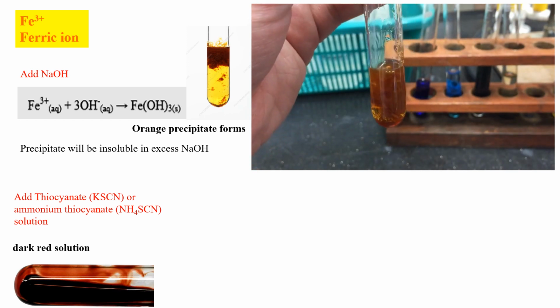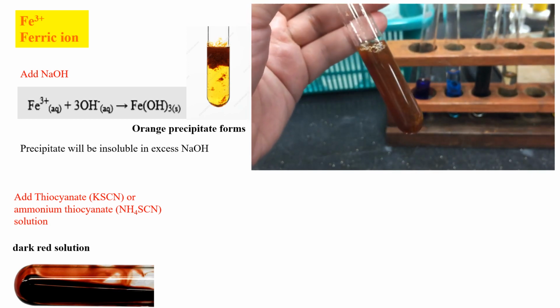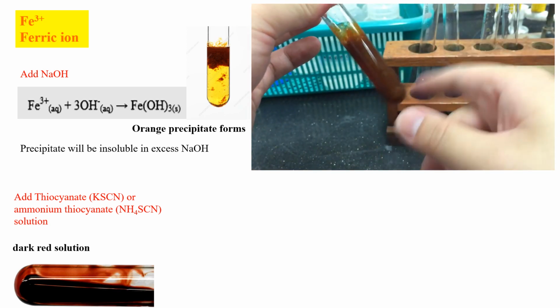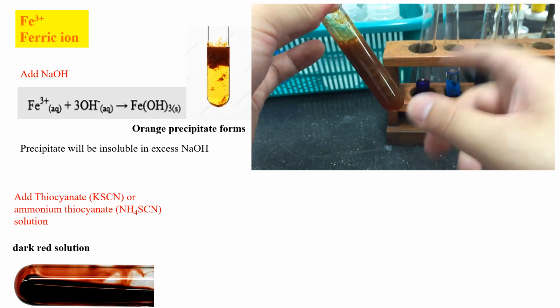Proceed to add excess sodium hydroxide solution. Notice that the reddish-brown precipitate remains insoluble in excess sodium hydroxide.